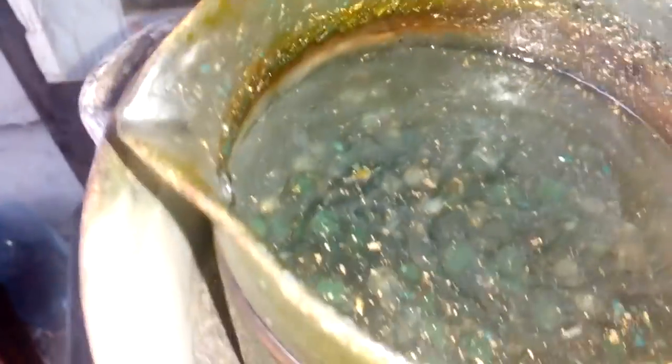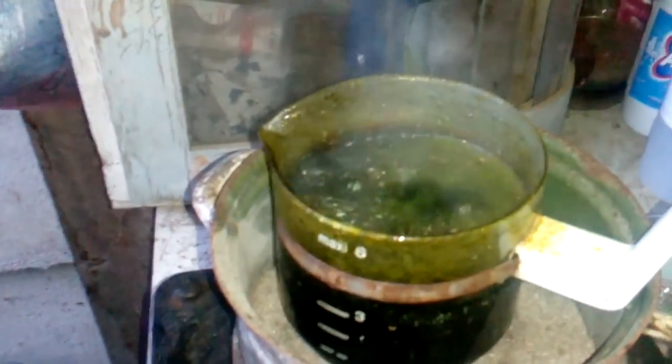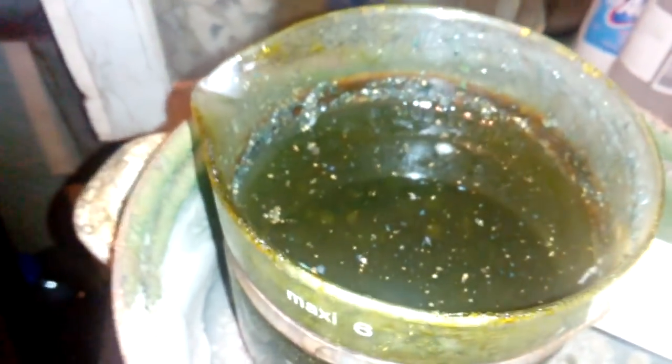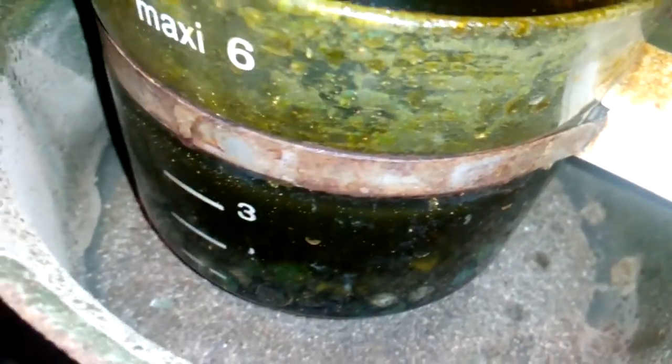After our first batch we make a second batch. Now we filter. The beaker is too small for the second batch. We got a vigorous reaction. Now we make even a third batch because two batches are not enough — still a lot of base metal here.